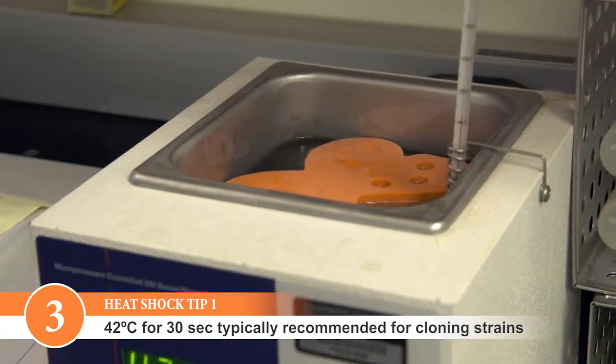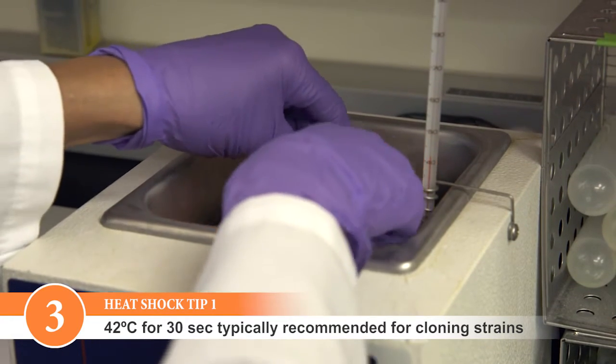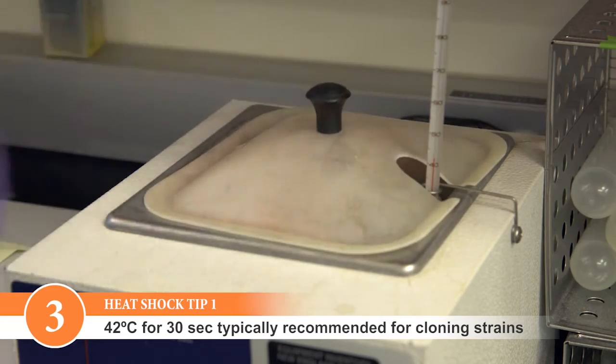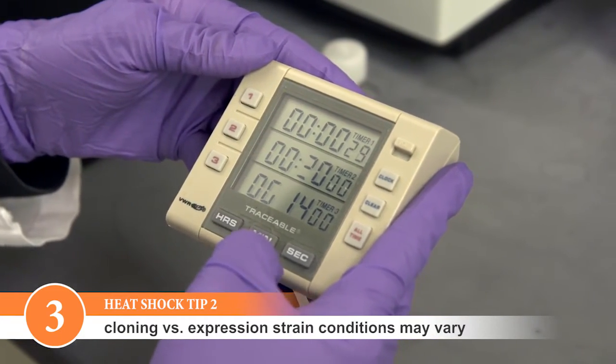Both temperature and time are specific to the transformation volume and vessel. Typically, 30 seconds at 42 degrees Celsius is recommended for cloning strains. Please follow the protocol for exact times as they vary for expression strains.